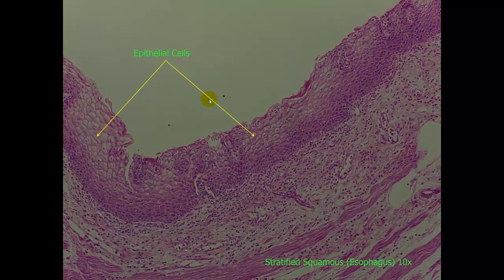Here is the same tissue at a 10x objective, and we can see that this is the tissue that we are looking for. It is multiple layers, and it is epithelial-style cells. Now, when you are trying to identify cells, keep in mind that you want to look at the cells that are on the apical surface, not on the basal surface. These cells on the basal surface will often have shapes that aren't typical of that tissue.